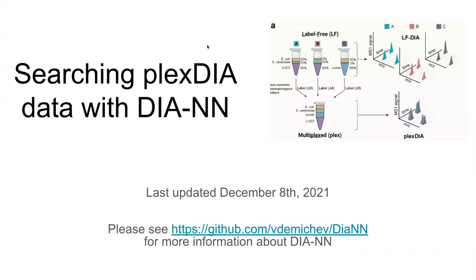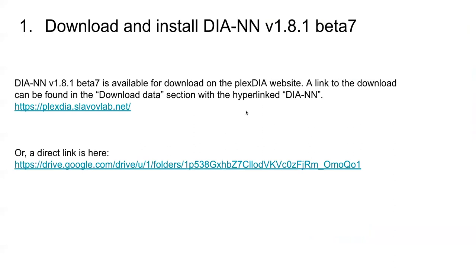Hi everyone, my name is Jason Dirks and in this video I'm going to show you how to search Plex DIA data with Diane. The first step is to download and install Diane. We have this beta version available. You can find the link to download it on our Plex DIA website, which will take you to Google Drive where you can download and install it to your computer.